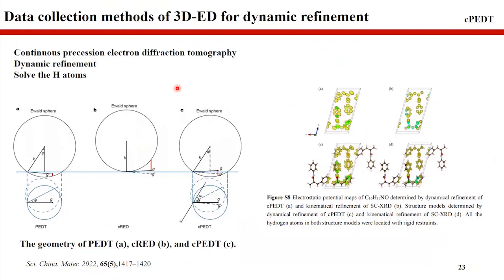Of course, the geometry of the diffraction by PEDT or cPEDT are both complex. So the real analysis would need to be careful, and the real analysis would be a little different.